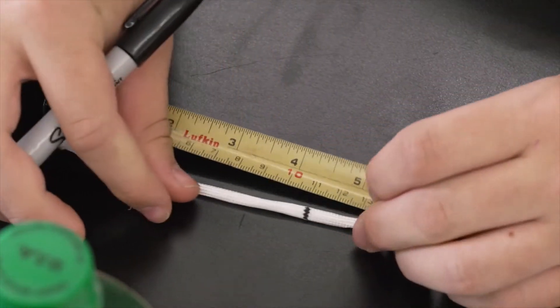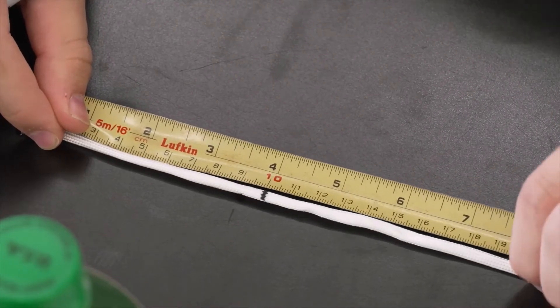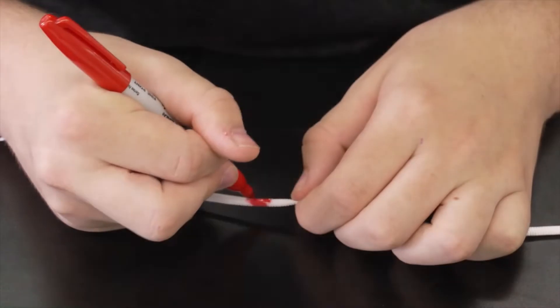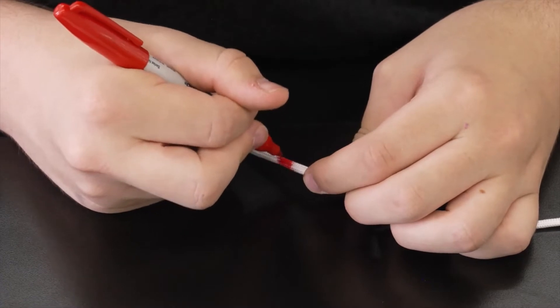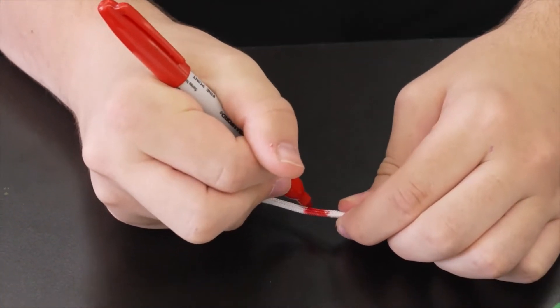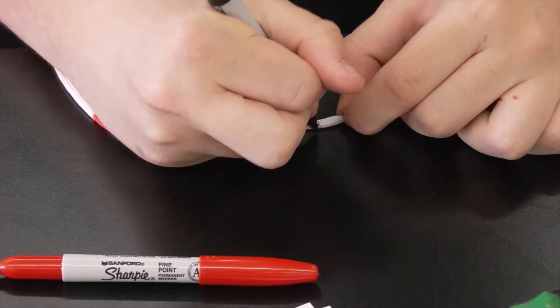Step 5: Mark a gauge on your rope. SecuDiscs made by research supply companies usually come with about 6 meters of rope. To help you read the depth more quickly, we suggest you mark every 10 cm from the disc to the end of the rope in black, and if you have other colored markers, it can be helpful to mark every 100 cm from the disc in a different color.